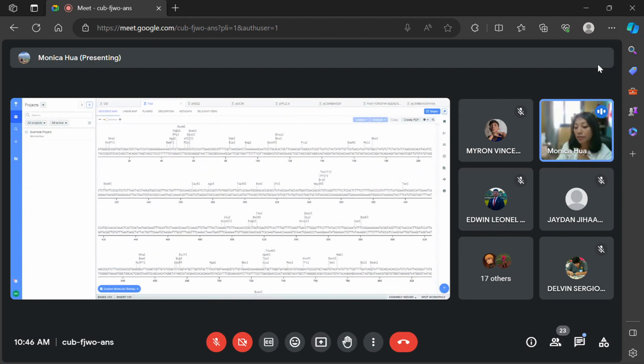I just want you to find the restriction enzyme site. I provided four just in case one of them doesn't work, because I didn't check your OD sequence. I'm doing FA as an example because this is your assignment. So we have to compare it to the OD one.